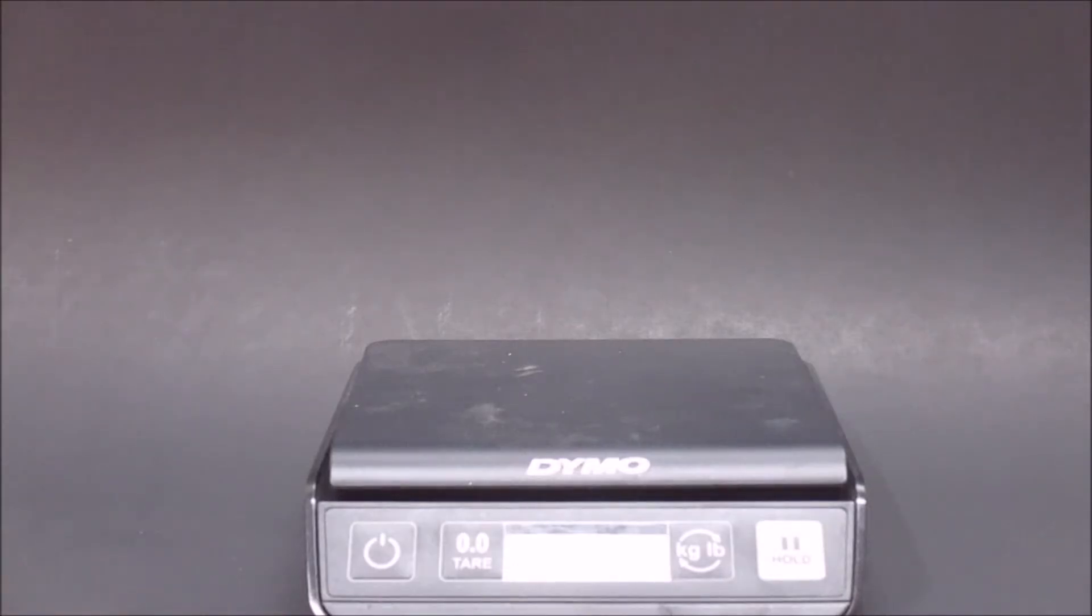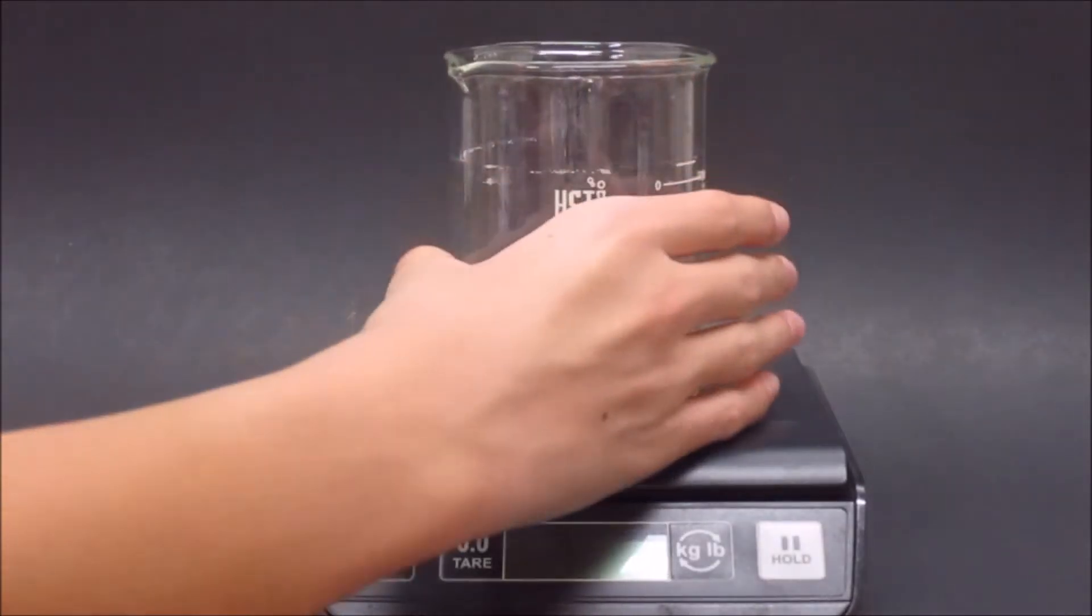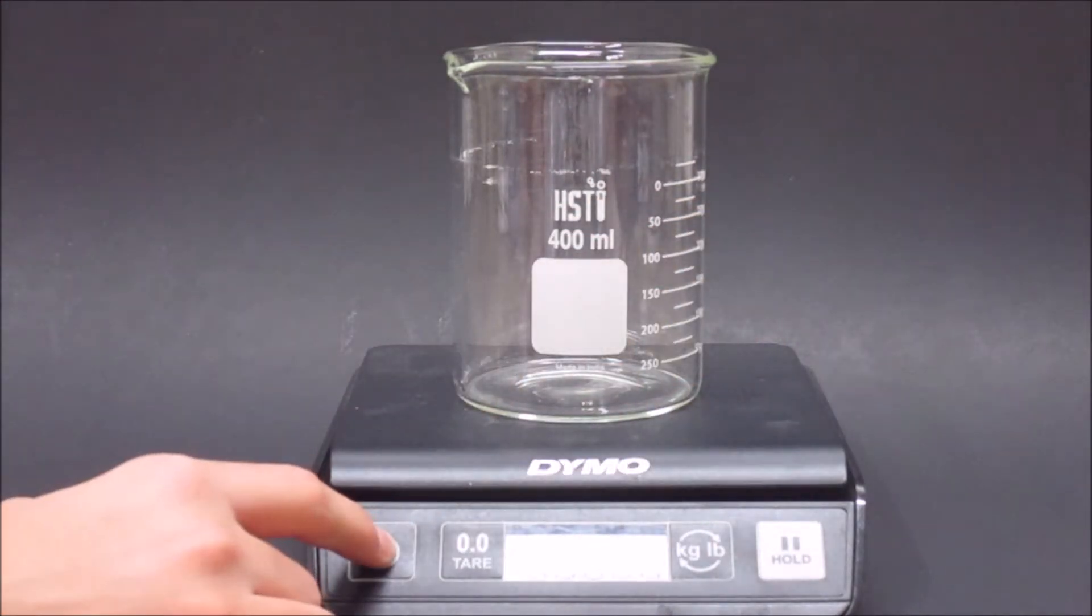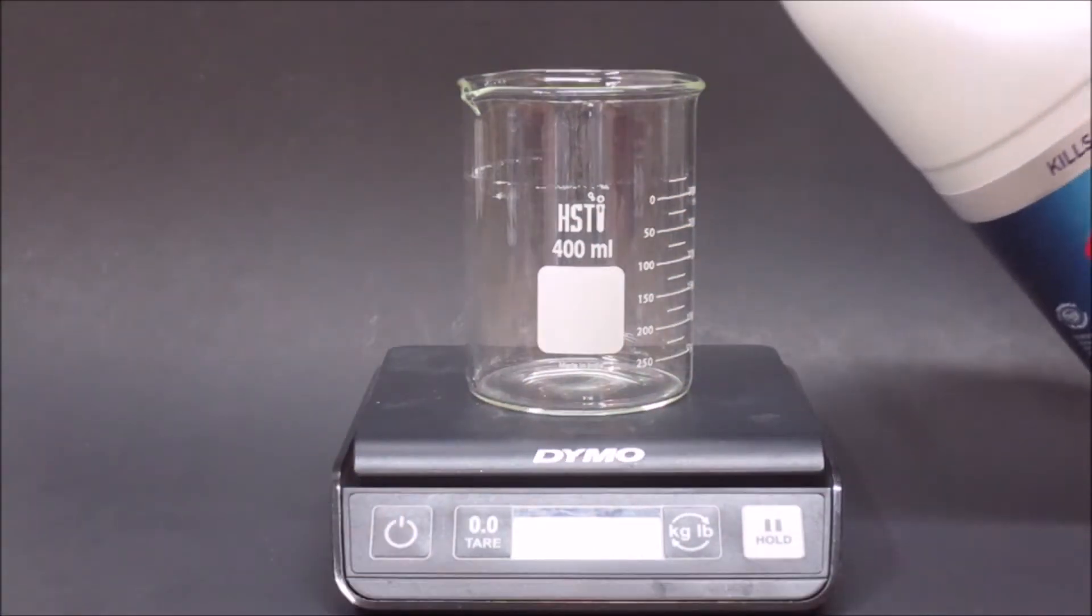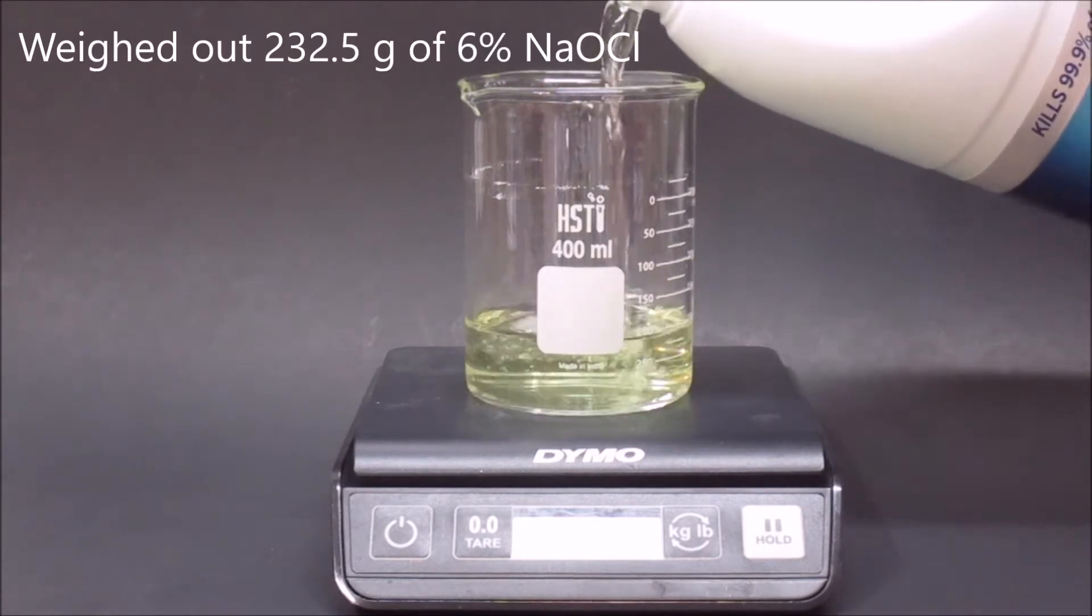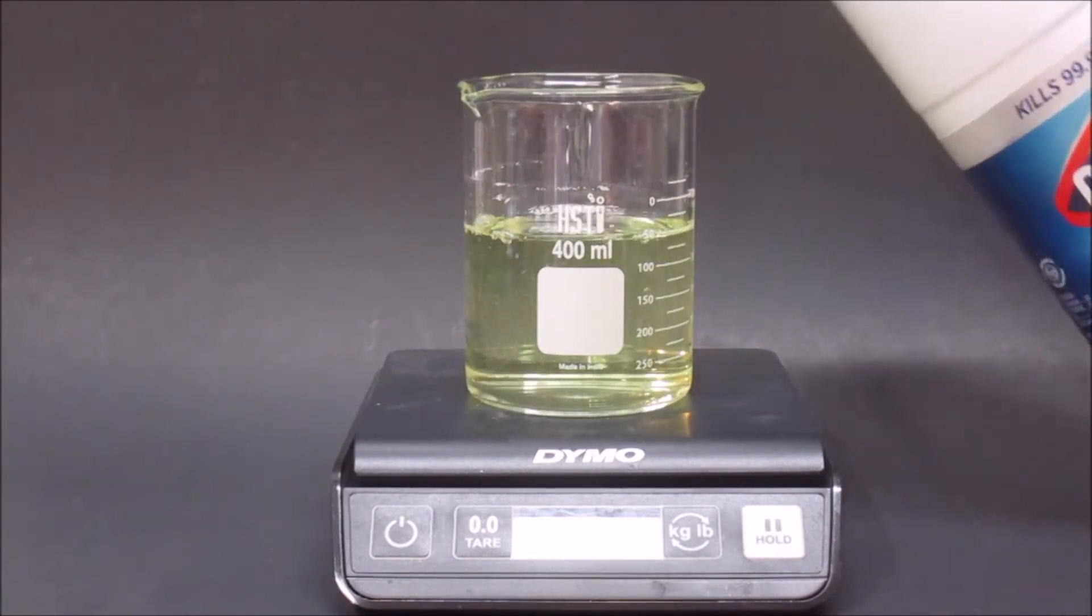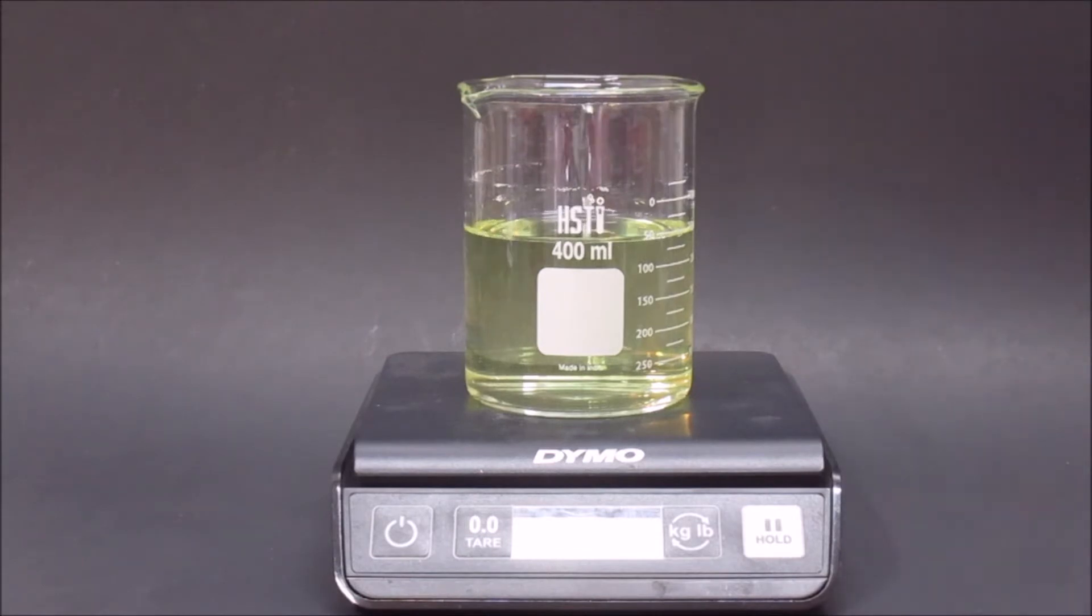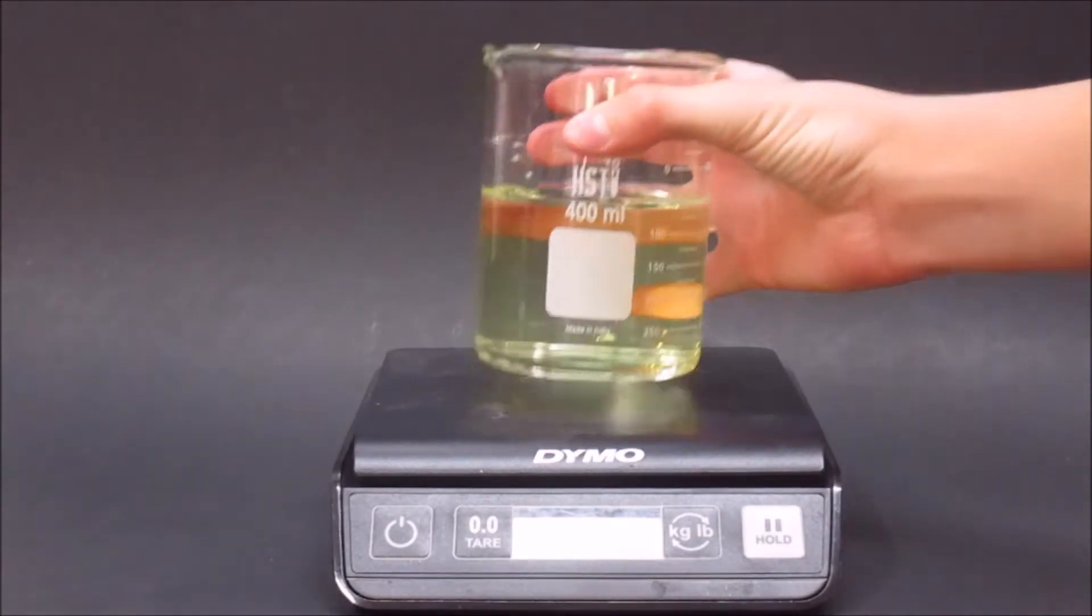To start, I got out my scale and then I put my beaker on the scale. I then weighed out 232.5 grams of bleach. After that was done, I took the beaker off the scale.